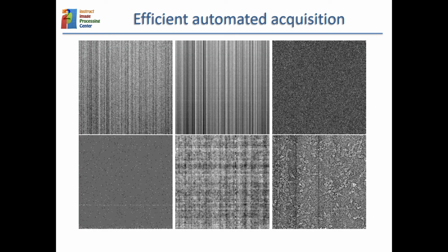Then more things related to the acquisition is the gain of the camera. When you are acquiring your images, you are recording the electrons arriving at the direct electron detector, and this sensor is an electronic device that depends on local currents of different transistors and circuits.